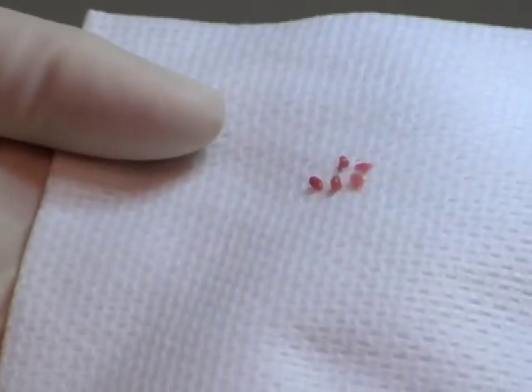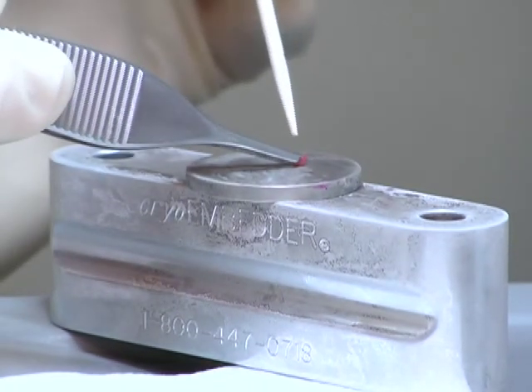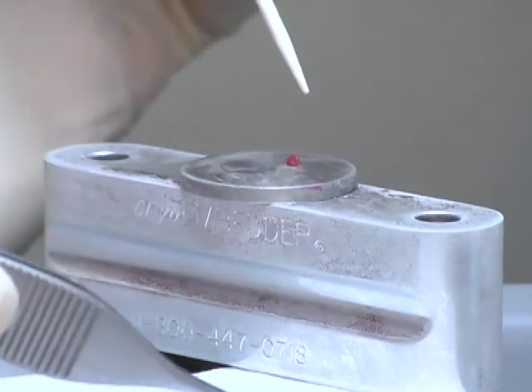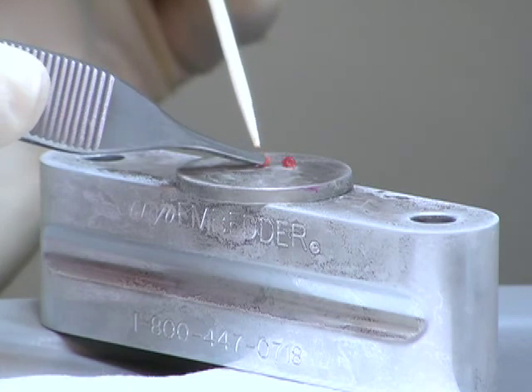When using a disc that has been cooled, small samples easily stick to the smooth steel and multiple pieces are all on the same plane during the cutting process instead of floating randomly throughout the block.